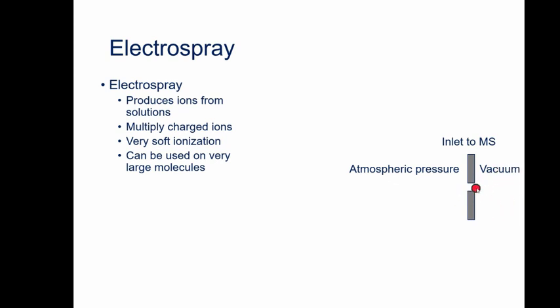And this hole into the mass spectrometer for electrospray is usually somewhere in the region of 0.5 millimeter to 1 millimeter in diameter, depending on the instrument, but usually less than 1 millimeter. Sometimes it's in front of the face of the cone, or sometimes it's in the plate. It doesn't really matter. It's more the diameter of the hole and the length of the tube behind the hole that govern the kind of vacuum restriction it's providing to the instrument.